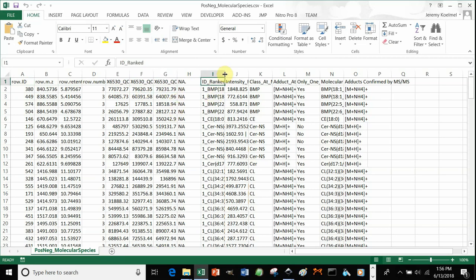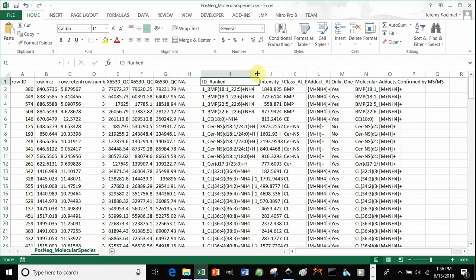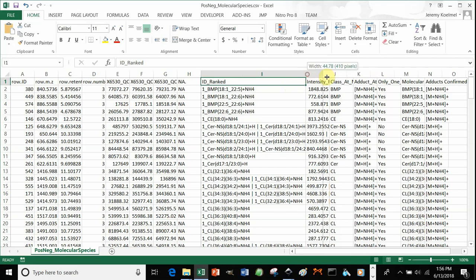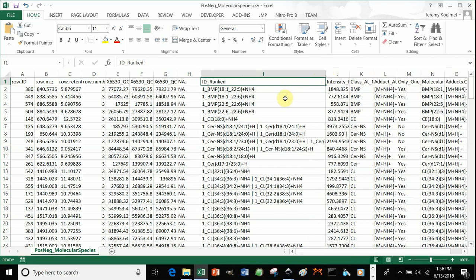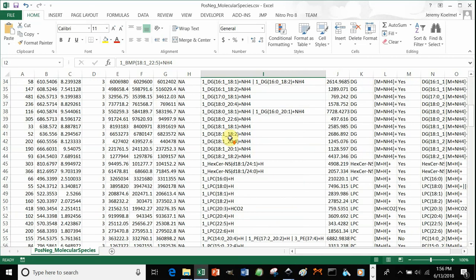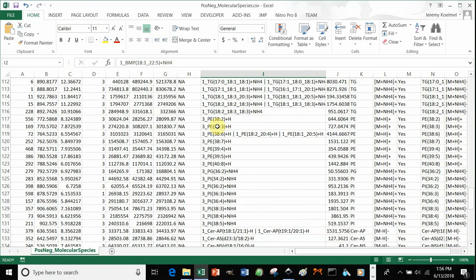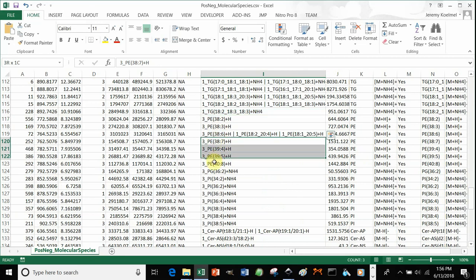Now, LipidMatch gives you a number of columns. There's the ID ranked. For example, this is scored as one underscore, meaning you saw both fatty acids for that lipid. It would be two underscore if you use AIF for thermo and it was identified. Three underscore, if we scroll down, means that it was only identified by class-specific fragmentation, not fatty acid-specific fragmentation.